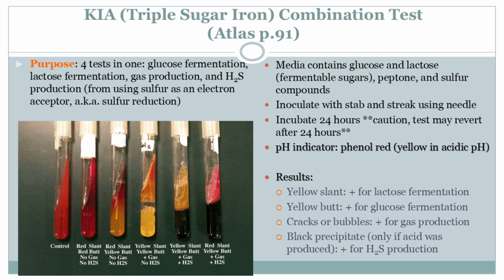So we're discovering new life, potentially, in our little test tube. Or it could mean that this bacteria has some unusual metabolic pathway. That means it's breaking down these sugars or this peptone in a way that we haven't seen before.